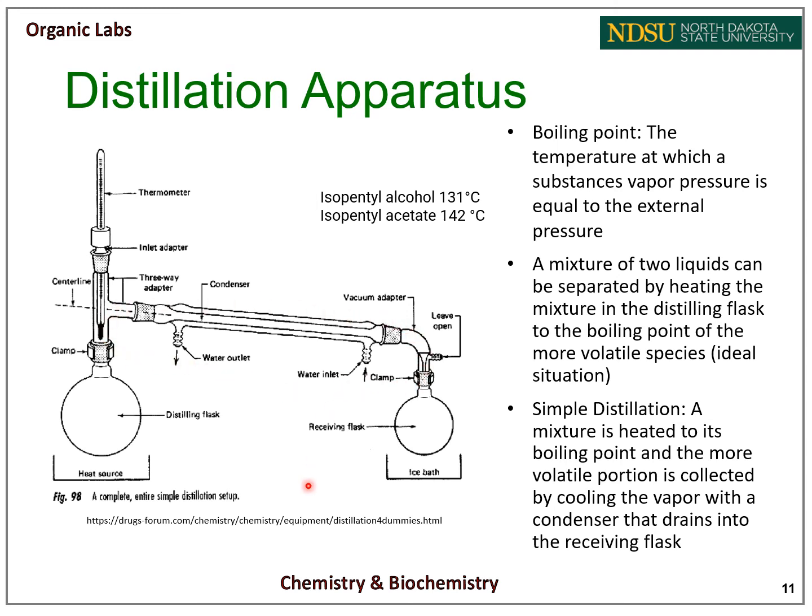The condenser will be attached to a vacuum adapter that is clamped to another round bottom, which is your receiving flask. This should be pre-weighed to collect your product. Attach the PVC tubing as described in the reflux.